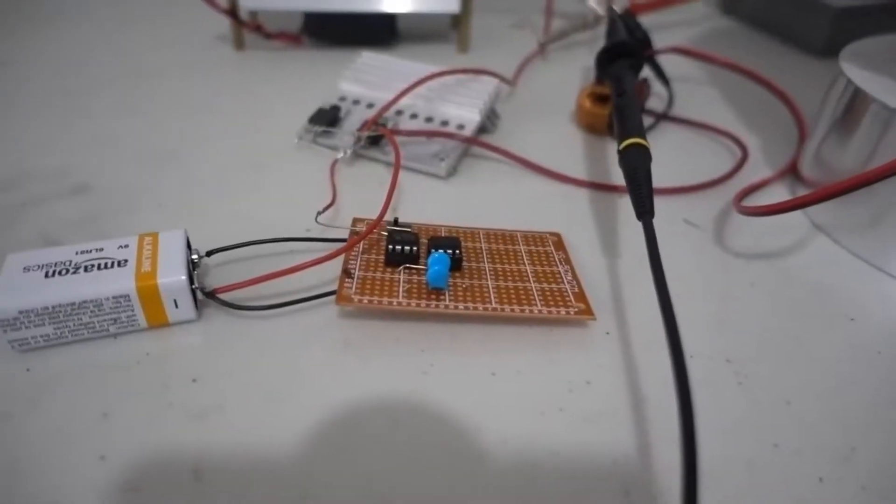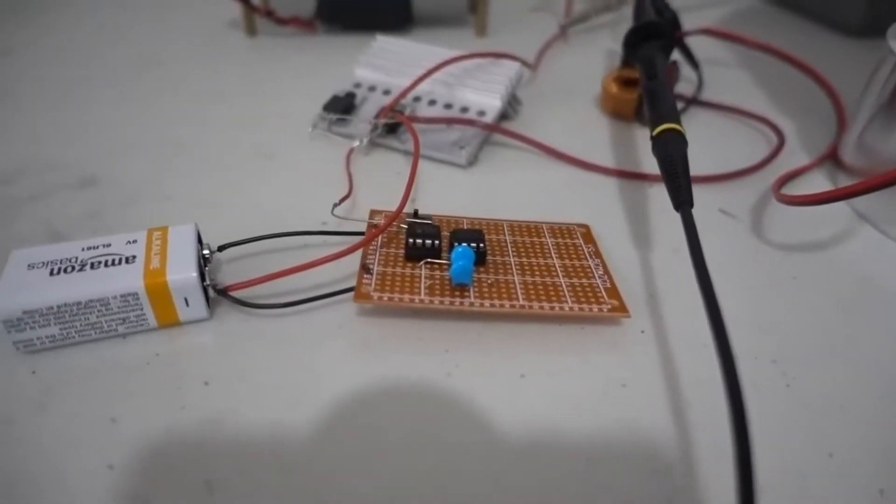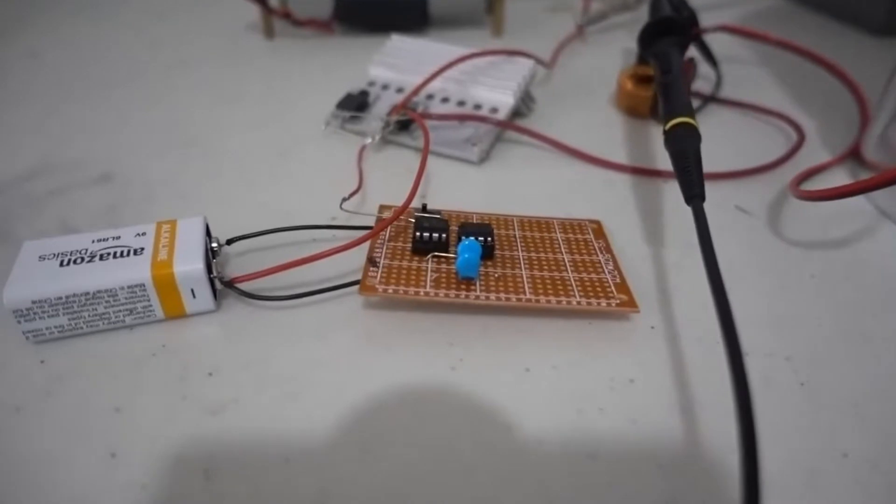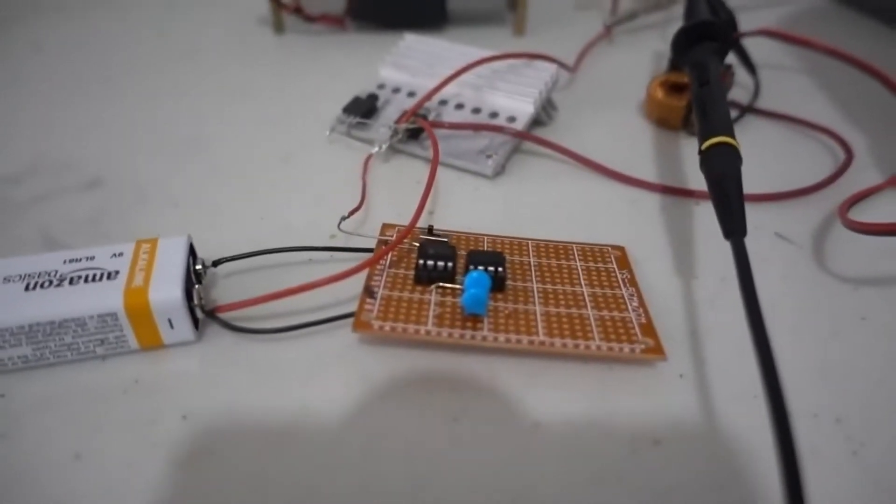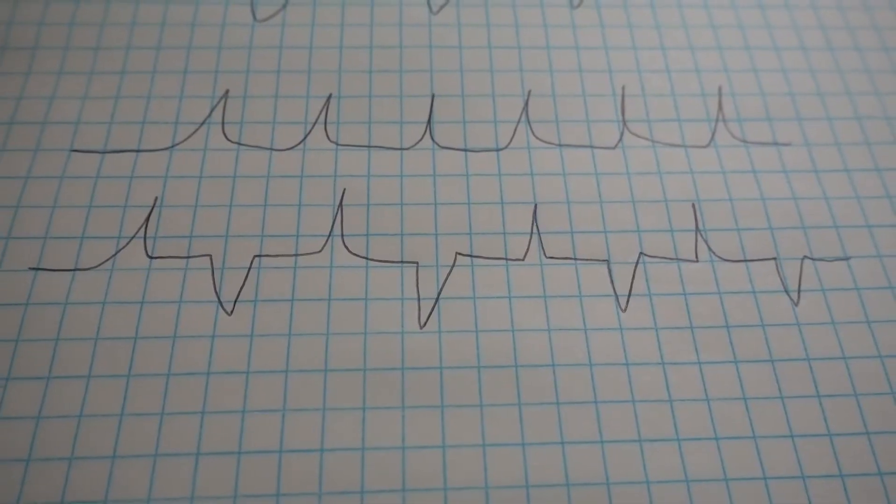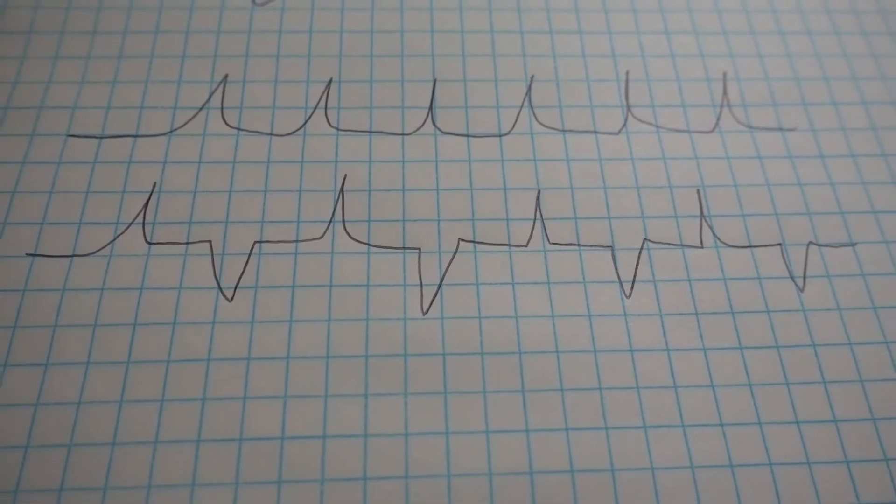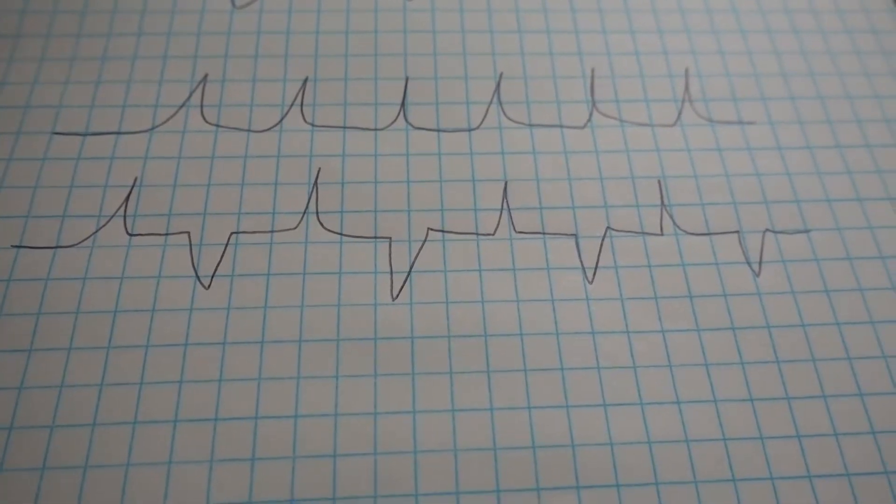So my previous one was actually made out of just a single NA555 timer, which is one MOSFET. The problem with doing a circuit like this for an ultrasonic cleaner is that you have just one-sided asymmetric pulses. And what you really want is pulses on both sides.